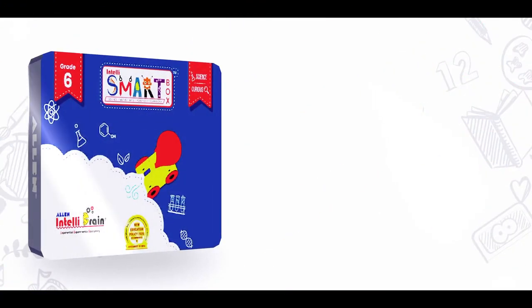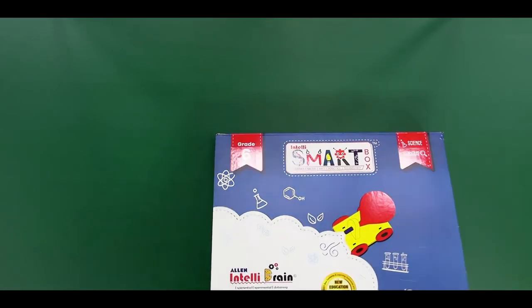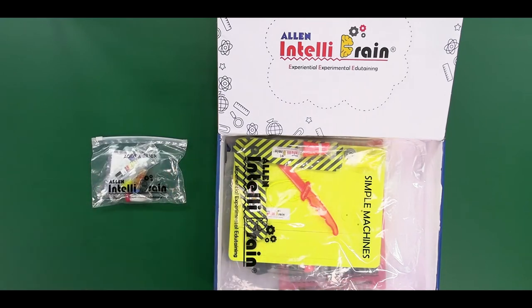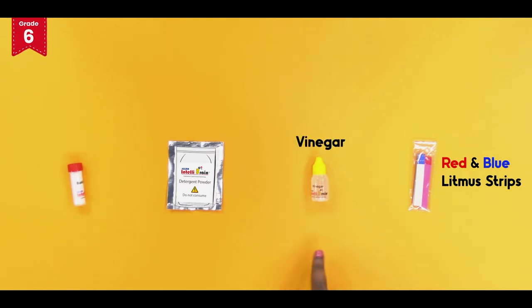From the IntelliSmart box, take out the acids and bases activity kit. From your acids and bases kit, take out the red and blue litmus strips, vinegar, detergent and baking soda.